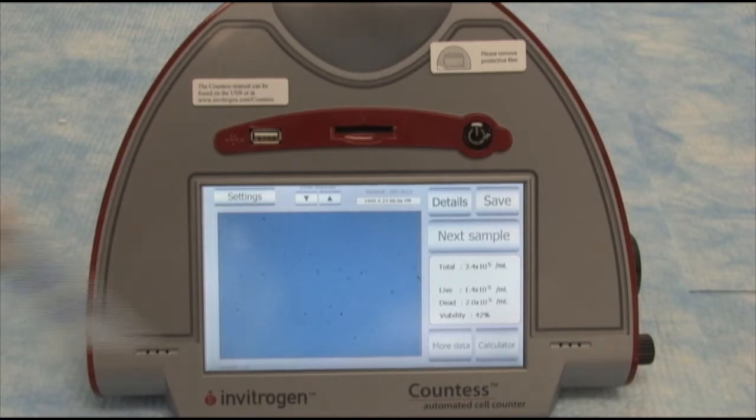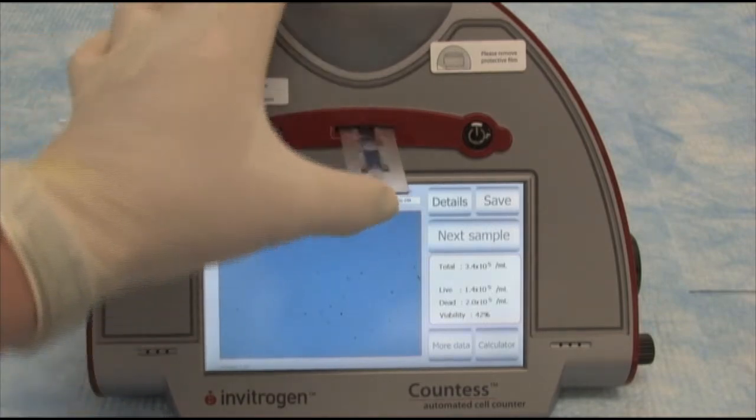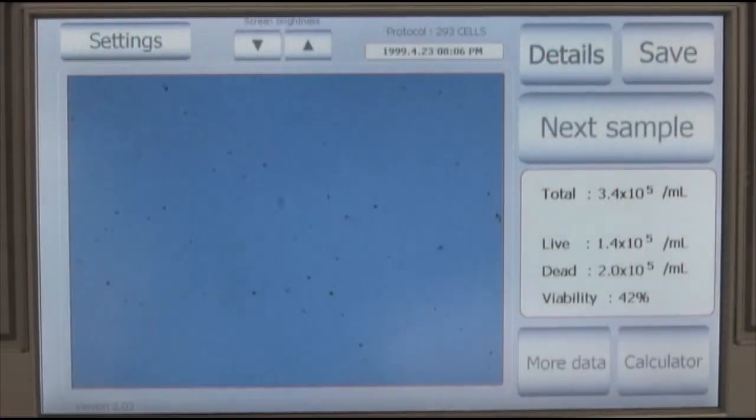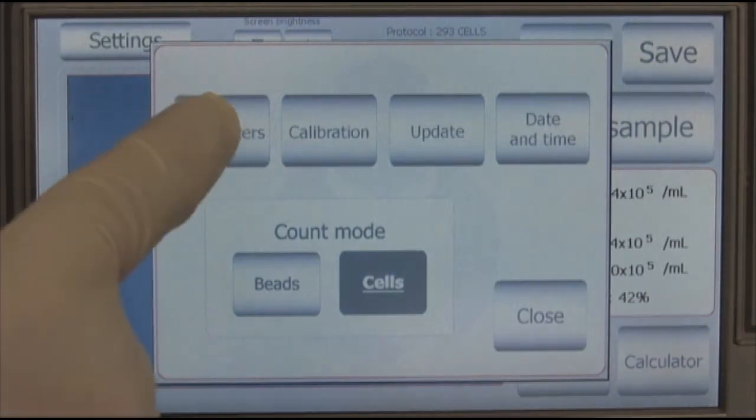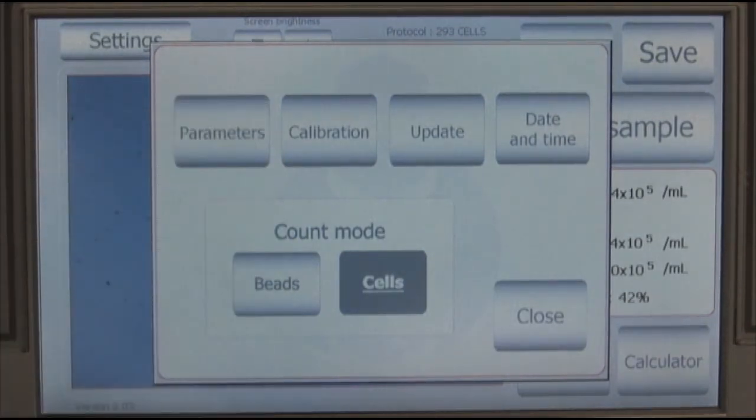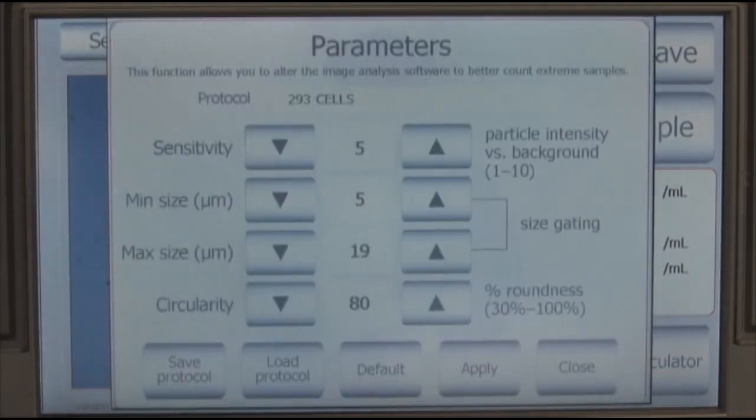I'm going to load the chamber slide into the Countess. I can go into settings, can set some parameters, maybe my sensitivity, my minimum size, my maximum size I'm looking for, can hit apply.